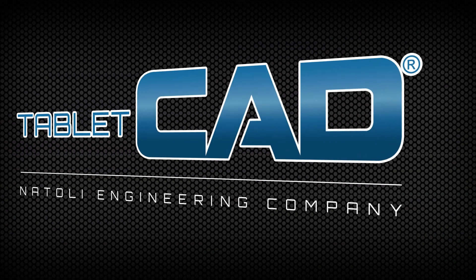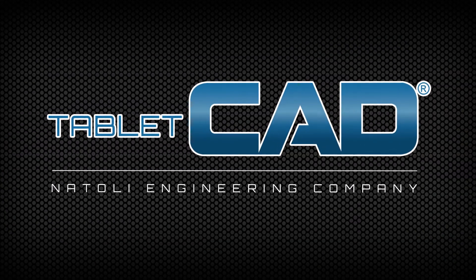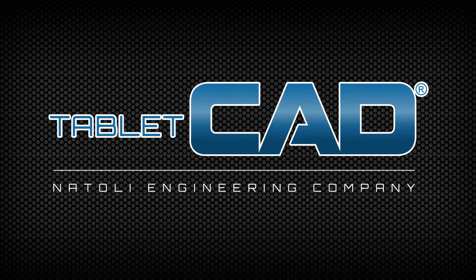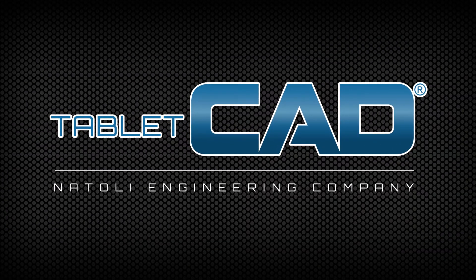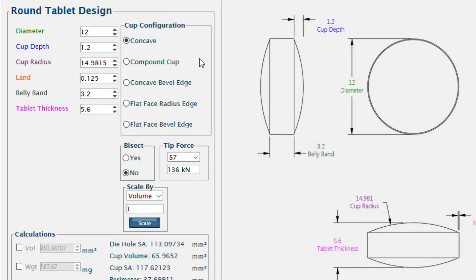Natoli's tablet design program provides a simple, cost-effective way for tablet manufacturers to create tablets to your organization's specifications. With this program, your tablet designs are a direct link to the manufacturing process, as tooling will be manufactured precisely to your models.